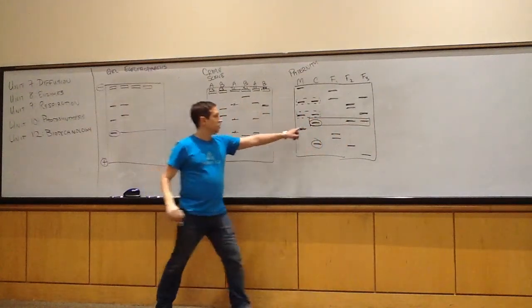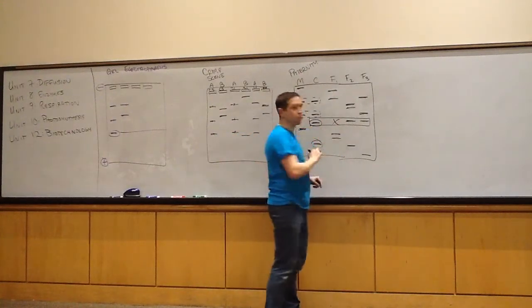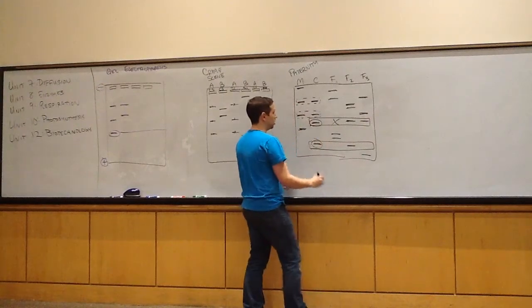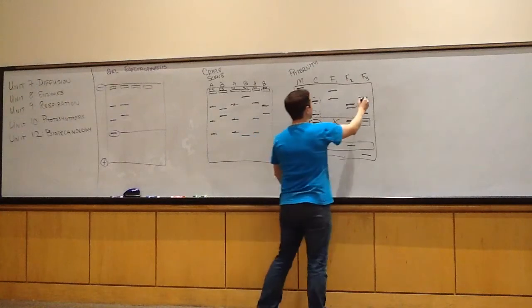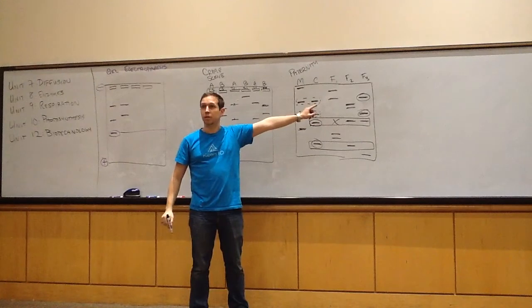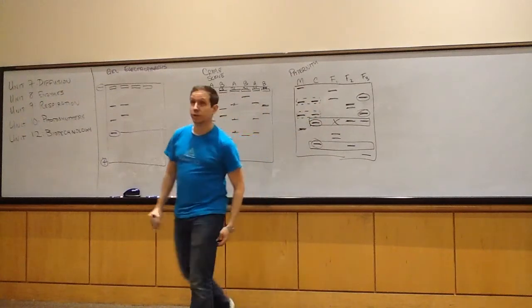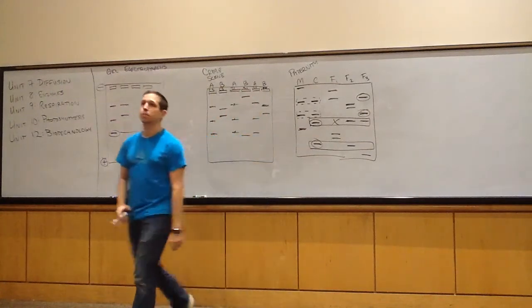The reason it's 2. Okay. Ask yourself, does father 1 have this band? No. Father 1 is not the father of the child. Father 2 and 3 do. But when we come over here, only this gentleman has that band. Now you'll notice that I specifically and purposefully drew in these 2 bands for that third person. The reason why this person is not the father of that child is because the mother already shares those 2 bands with the child. We're looking for the 2 bands that the mother does not share with the child to determine paternity.